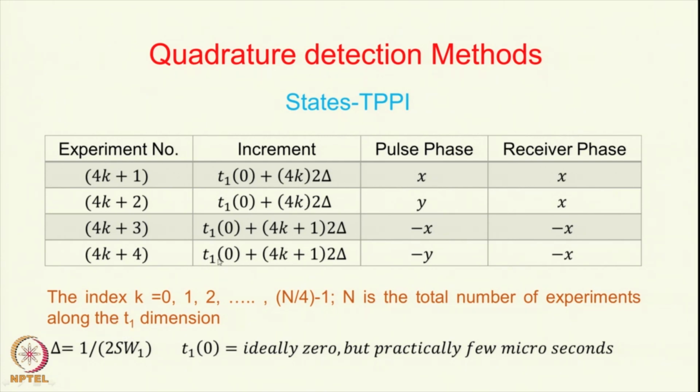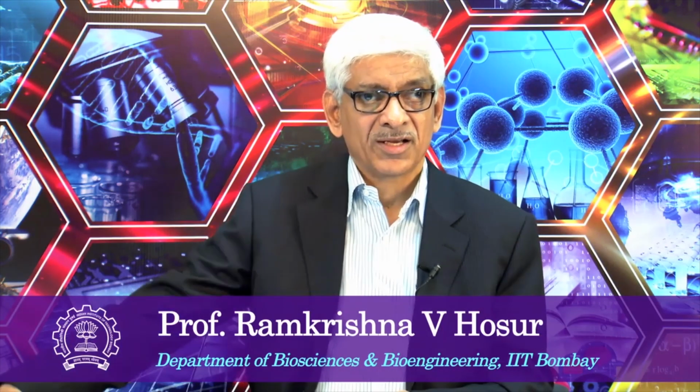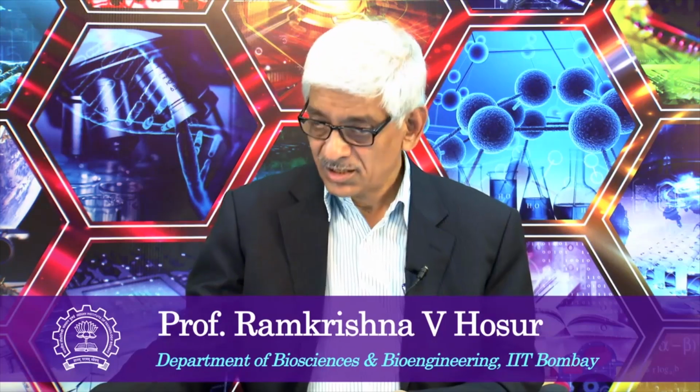So the States-TPPI and the States methods are most commonly used, and eventually they achieve the same result of discrimination of the positive and the negative signals. Now having said this, we have to discuss the various kinds of 2D experiments. We have generally covered the principles of obtaining 2D spectra, how to record 2D spectra, how to obtain pure phase experiments, and this will allow us to discuss the different experiments. There are various kinds of 2-dimensional NMR experiments, and we will discuss these in the coming classes.